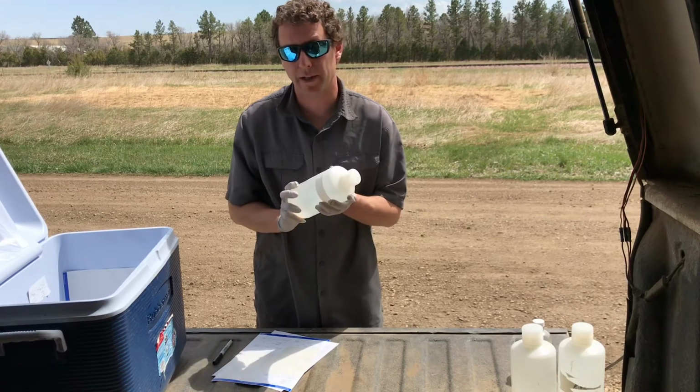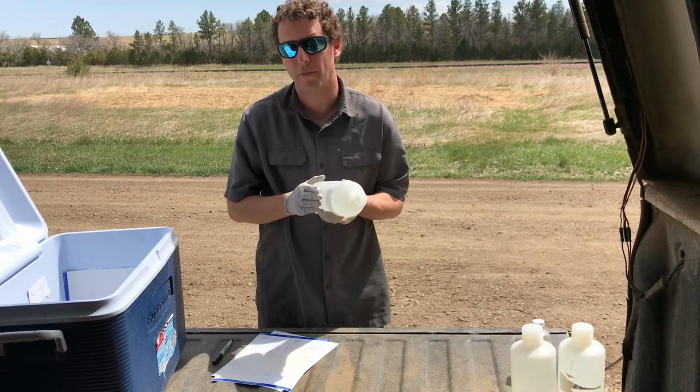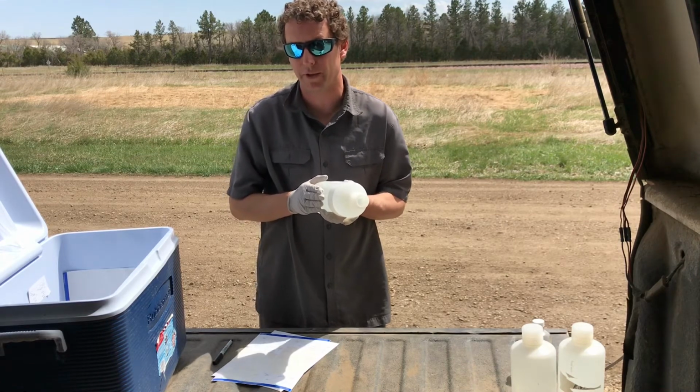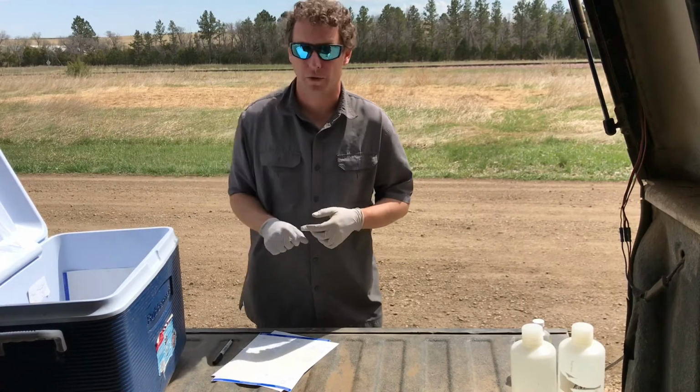The reason we do that is because we want the pH in this water to drop far enough that there's no biological activity that uses up nutrients, because the B bottle is our nutrient sample. Then that B bottle goes in the cooler under loose ice.